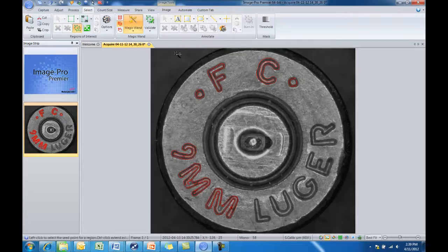And once we had enough selected, we would then choose to validate it, meaning turn it either into an ROI, a measurement, or an annotation. So in this example, we'll turn it into an ROI, and that way we can filter on these objects or later convert them into measurements.